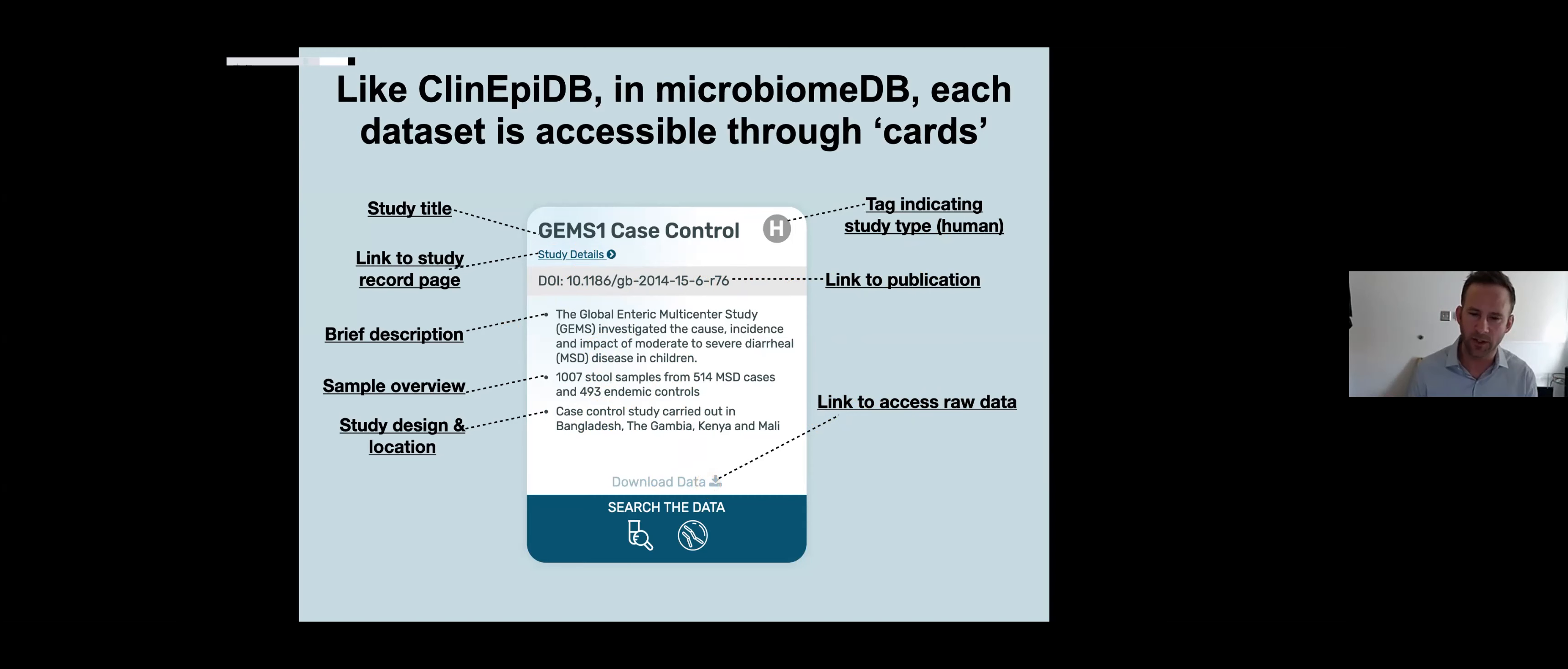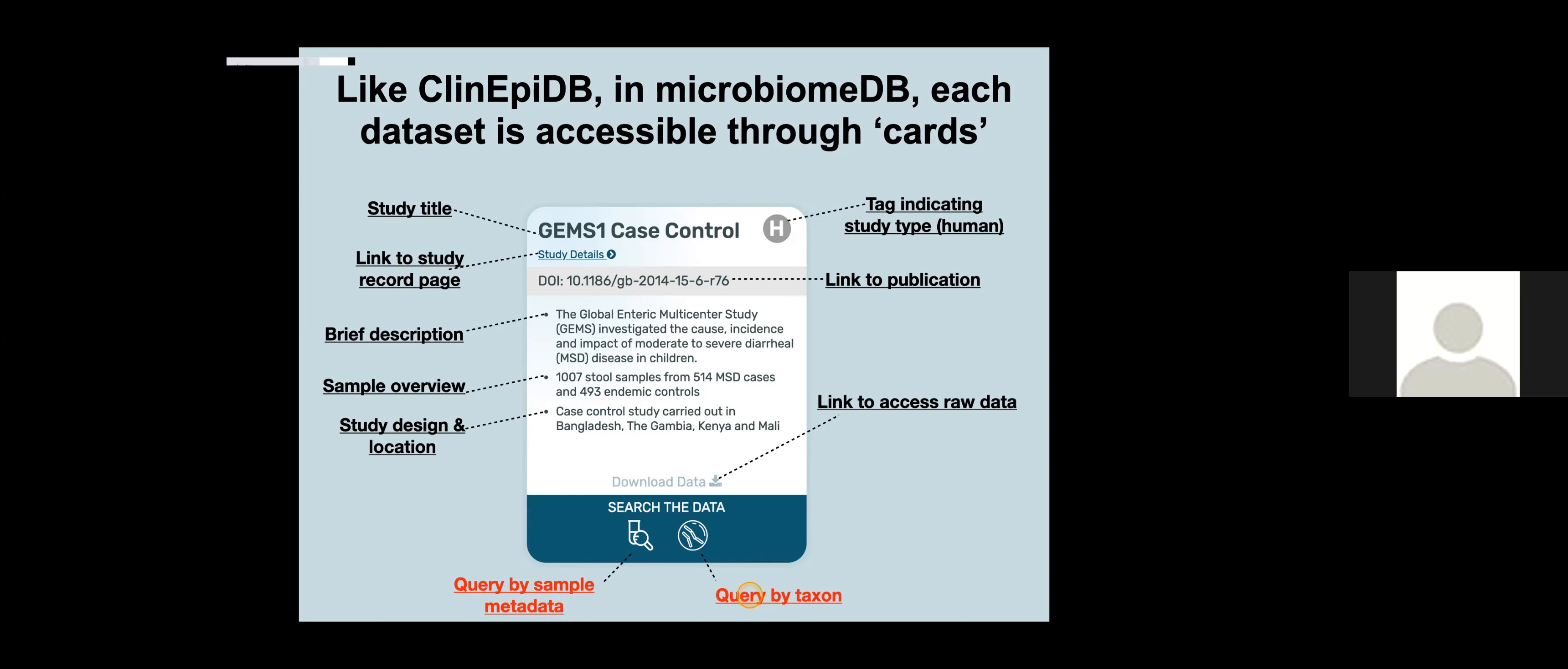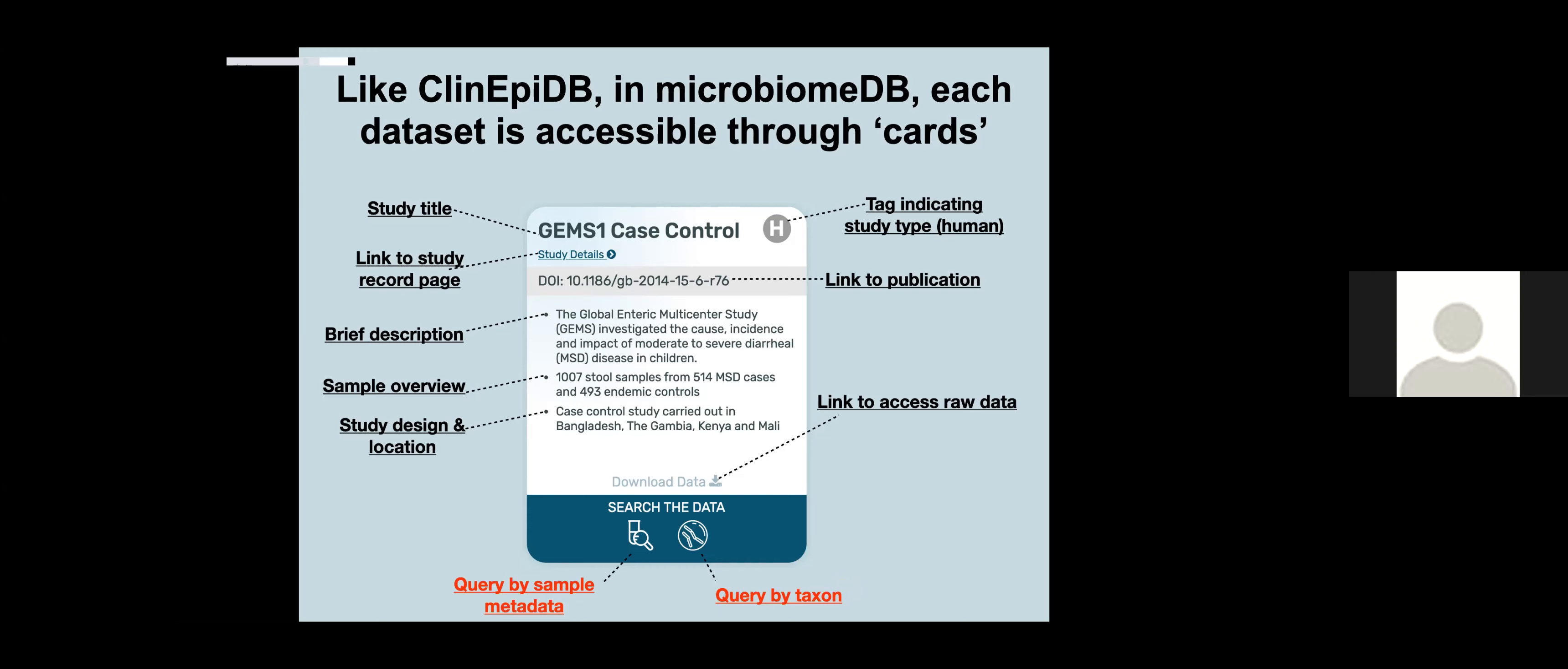What's different here is how you search the database for MicrobiomeDB compared to ClinEpi. We have two searches. First, you can search the entire database or a single study to find samples based on metadata that the experimenters collected about those samples - we call that sample details. Those are things like age, weight, disease status, country of origin. Then we have a second way to query the database by taxon, saying I don't care about any of the metadata, I just want to know all the samples that had E. coli above 80% of the microbiome. That's a query by taxon, finding samples based on the abundance of a particular taxon.